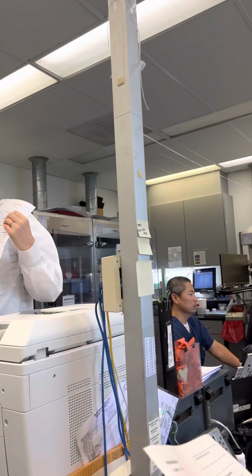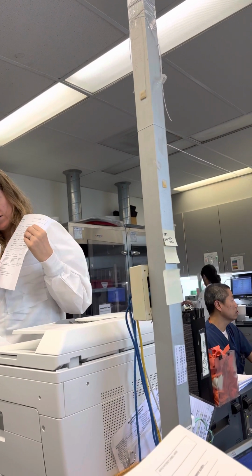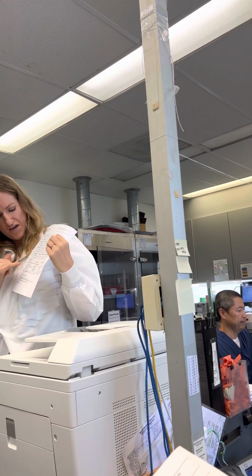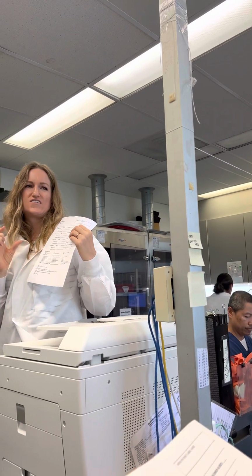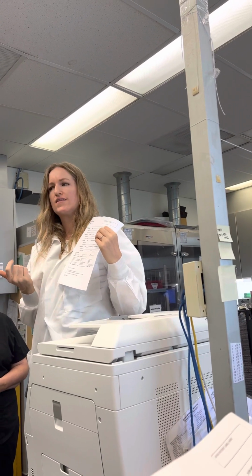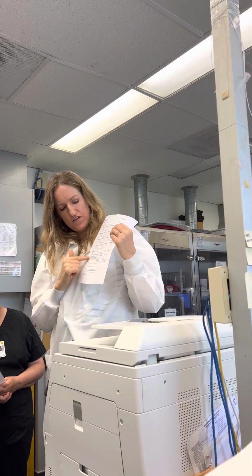We also copied over all of the micro tests that were on your original requisition, so those are all here. So if you are wanting to send something for micro, you have the option to check all those off as well. And I have here next to the micro test fresh, meaning it would be a no fixative. That's when you guys are sending us those glass vials with the black tube. I don't know if there's saline in them or if it's just nothing. Saline in ours. Okay, so that's fine. And then you would check off those.